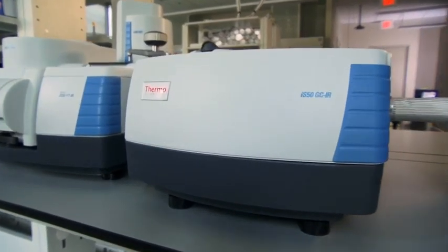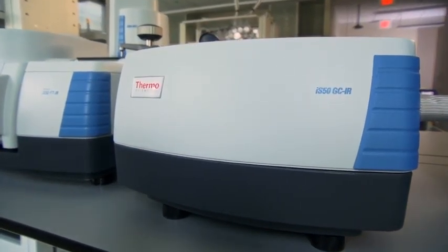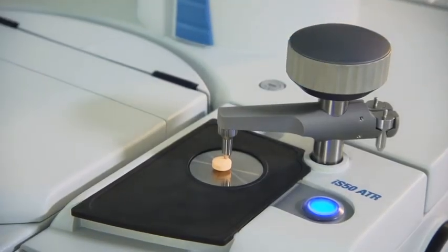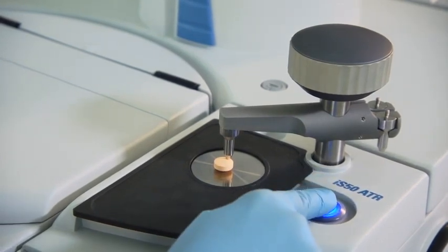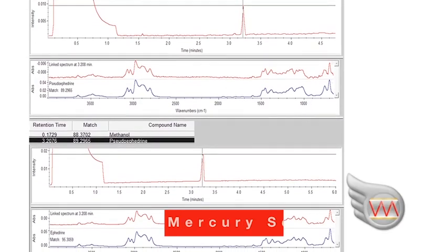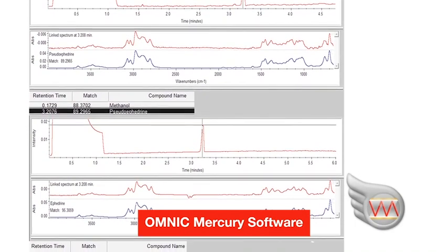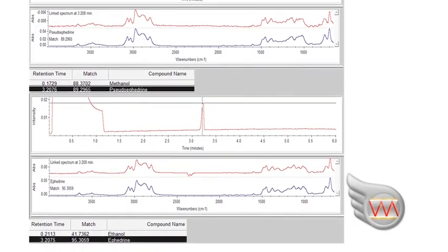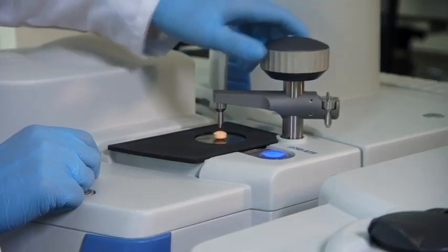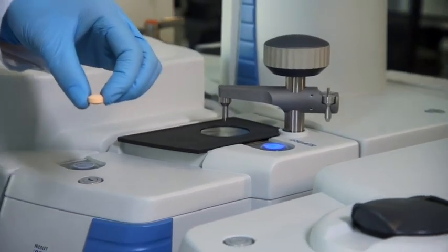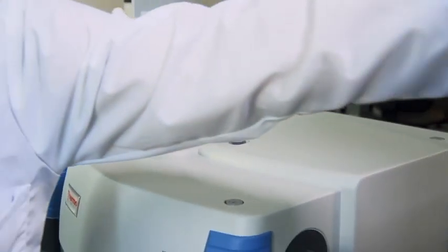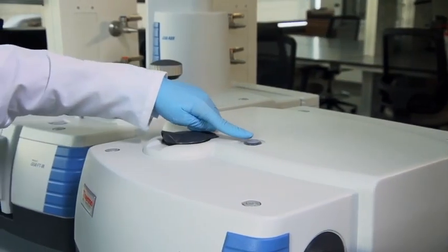It's just as easy to combine gas chromatography with FTIR to analyze differences between isomers, like ephedrine and pseudoephedrine. Our Omnic Mercury software simplifies drug analysis, reducing hours of manual peak identification into minutes, and no matter who the operator is, the results are the same. Fast, easy, consistent, and cost-efficient.